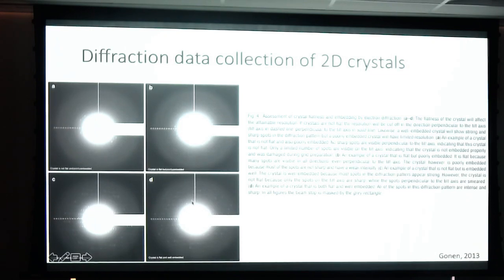And then D is the ideal crystal, where it's going out very well in all directions, and it's a well preserved crystal. The spots are very sharp and go all the way up to high resolution in all directions.